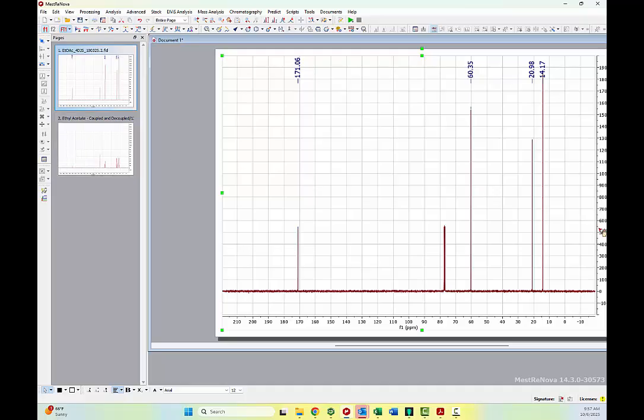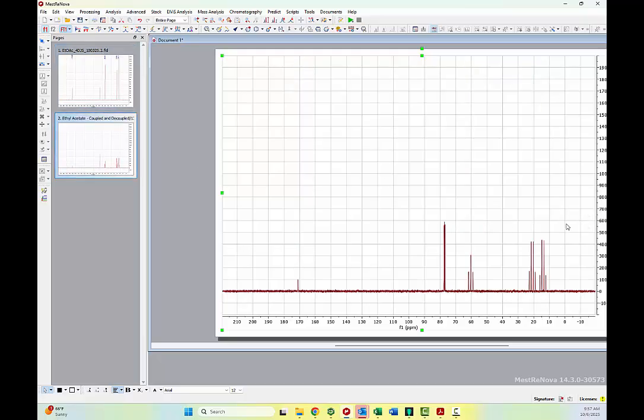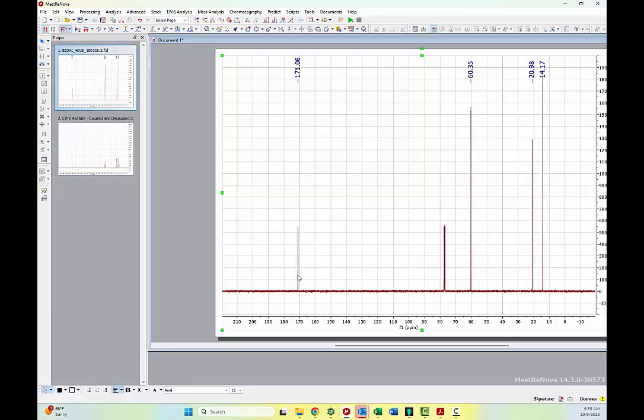I just collected them via 2 different pulse sequences, which means that the CDCl3, which has no hydrogens, is unaffected by the 2 experiments that I have run, and its intensity shows up at approximately 550 to 600 in both. And what you notice now is because these are all singlets, they are much taller.